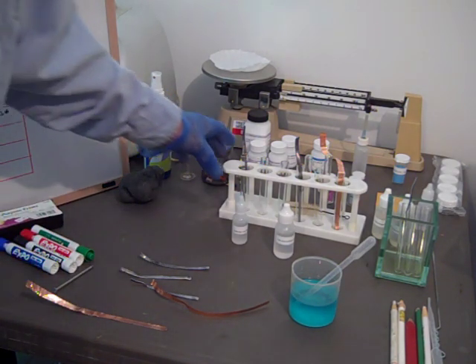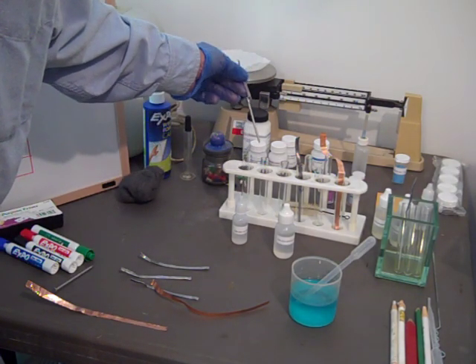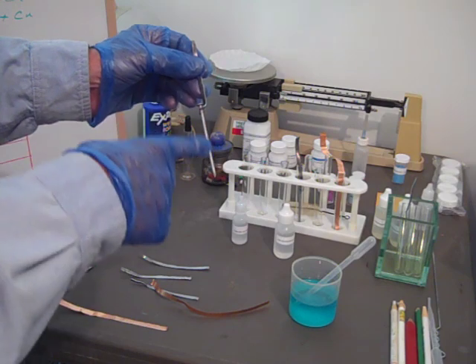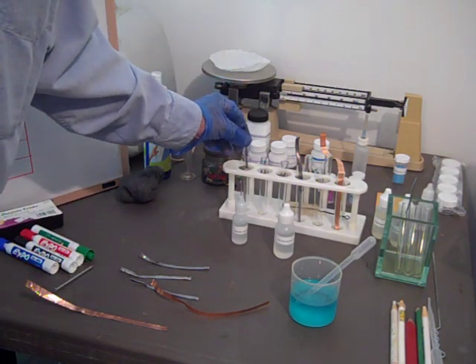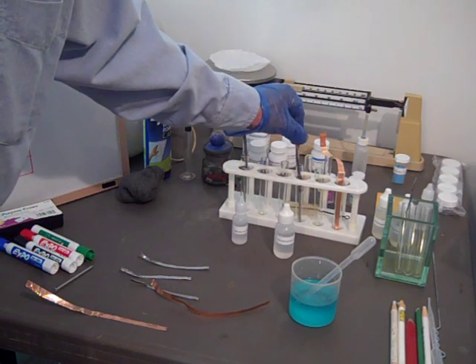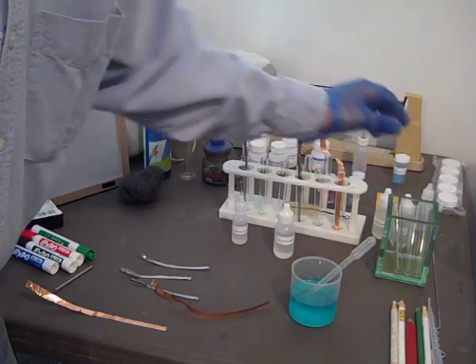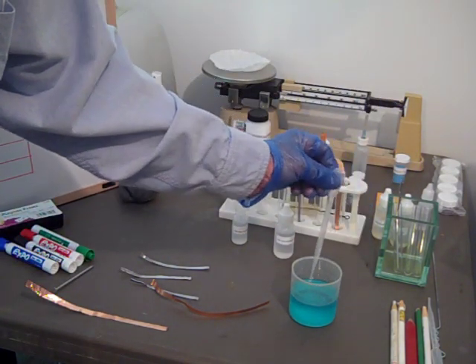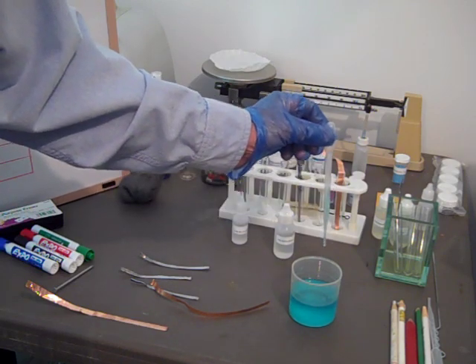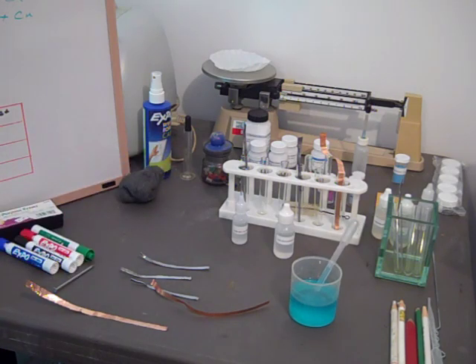We also set up some test tubes with galvanized steel nails. So the galvanized is the zinc coating on the outside of the nail. We've got three of those and little pieces of lead to help us get them in and out. Set up, one over here. We have prepared a solution of 0.2 molar copper sulfate, and we're going to add 3 milliliters to each tube for each section of the experiment.